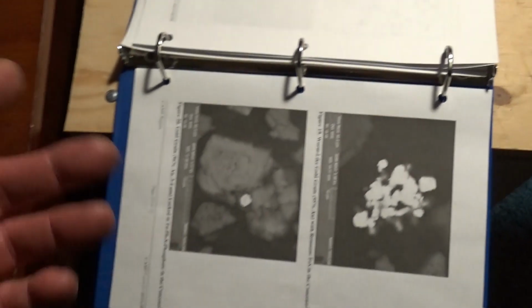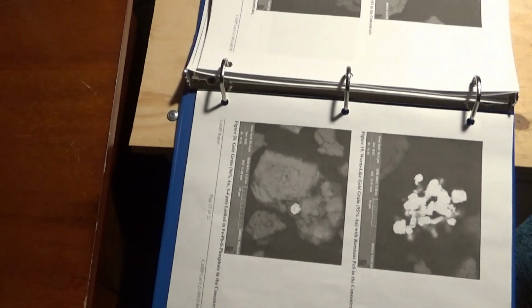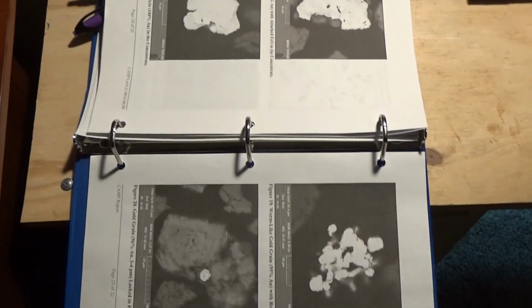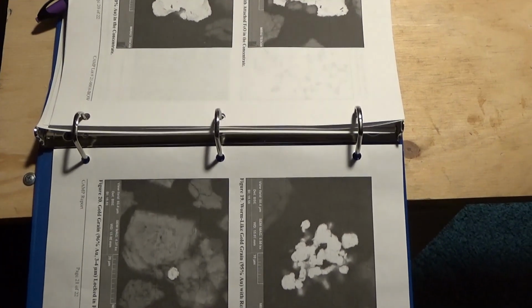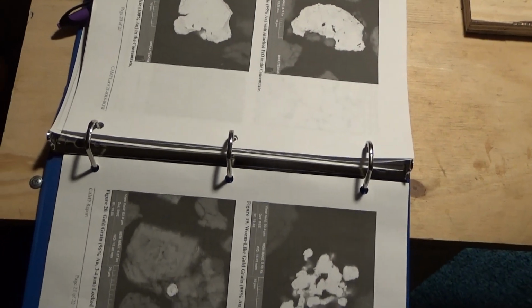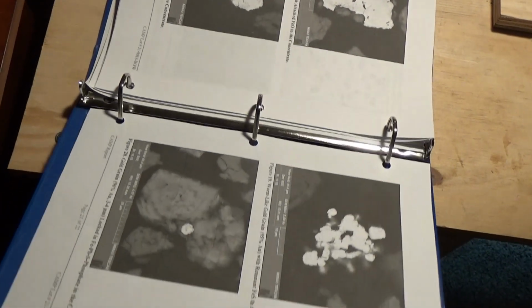Now, because of the preliminary tests, we wanted to see, first of all, if a magnetic separation would work, if a low throughput but high precision gravity separation will work, and we may do some flotation experiments here in the near future.